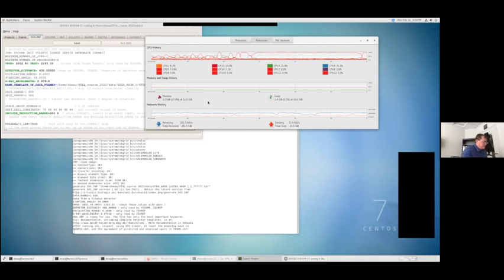Okay, so I have an example here, a data set that was collected 450 frames at a detector distance of 300 millimeters, run on our cluster, which uses jobs equals 8 and processors equals 8. For the integration step, it takes 15 seconds per job, for a total time for the integration step of 28 seconds. Okay.